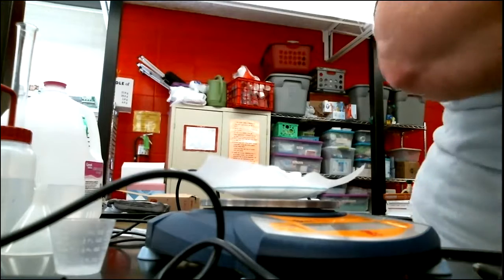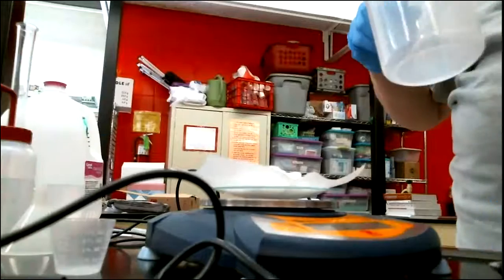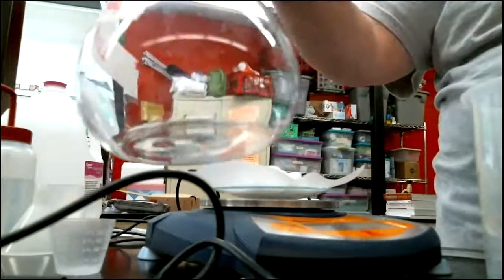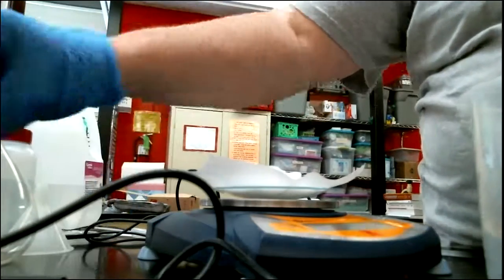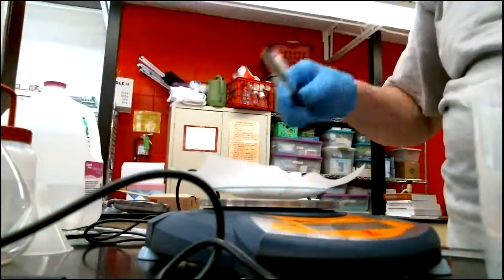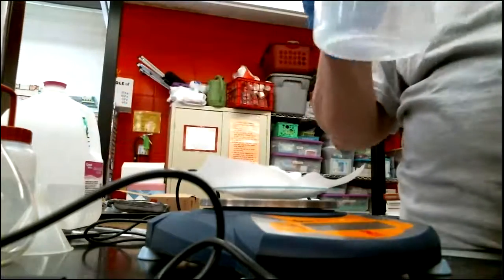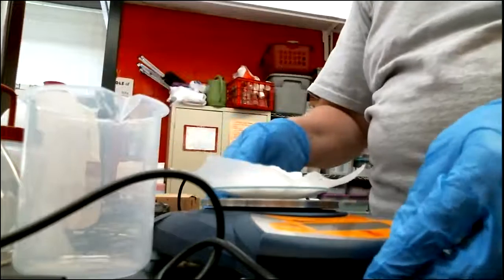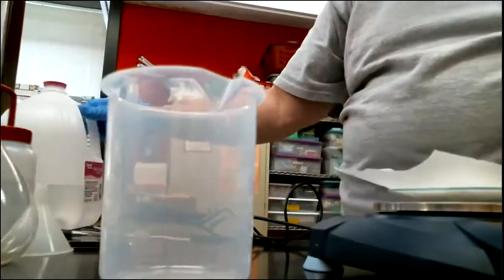All right, so I've got my Epsom salt. Now, if I tried to take all that Epsom salt, put it into this flask, and then start dissolving it, it would probably work. It might take a minute to get it all done. Plus, it is a lot of salt. So I'm going to start my process using a beaker first. I'm going to put some water in the beaker and then start dissolving it there, and then I'll transfer it to the volumetric flask.